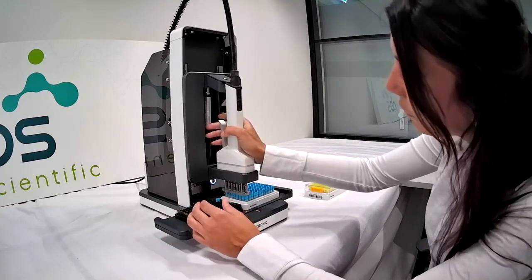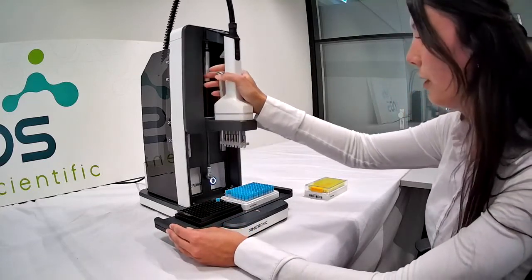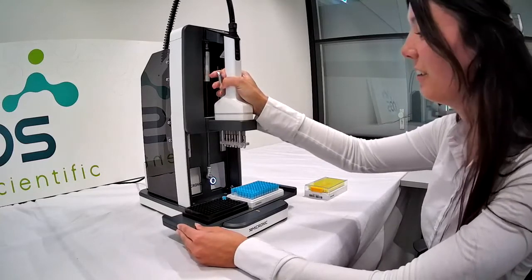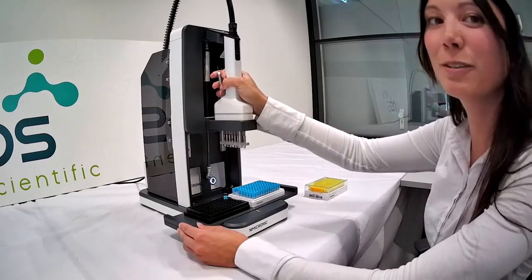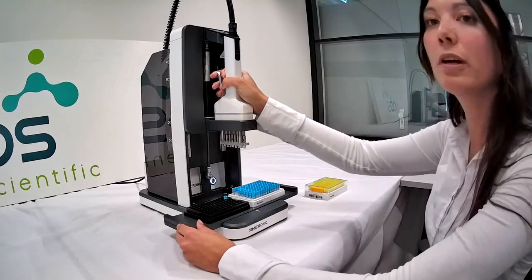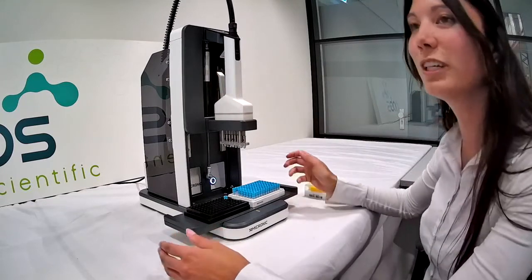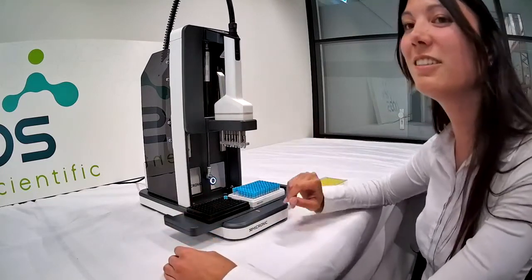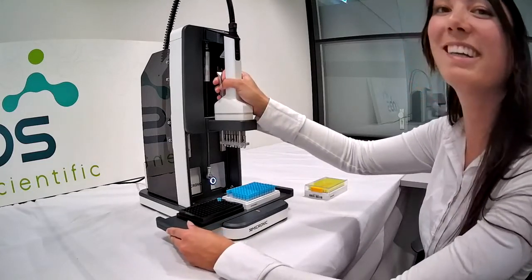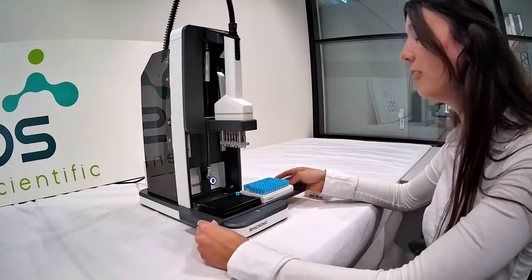And then you have the handle to release the tubes. So I missed one. I'm sorry for that, but I'm not really aligned with the system because we have the camera over here. But if you normally work in a laboratory system with your normal chair and a good position, you will recap and cap much better than I did. So that is how it looks.